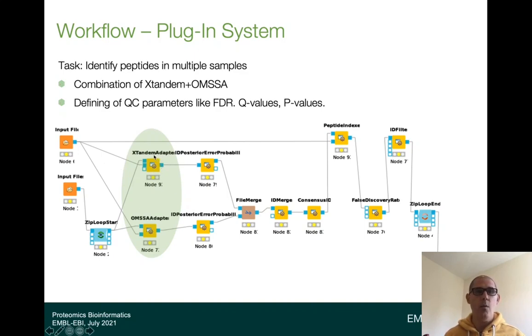We just say, okay, I also want to put here X!Tandem, because in my analysis I have more computer power, and I want to increase the probability of identifying my peptides by using another search engine, and combine the data coming from two different search engines to have a higher probability of identifying my peptides, identify more proteins, and finally quantify more proteins.